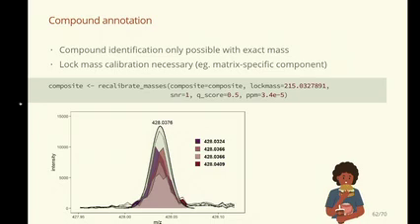So compound annotation, of course, reality is also difficult. If you really want to query databases, you will likely need a matrix-specific compound, for example glucose, and then shift towards this glucose. But together with the inter-batch mass corrections, the spectrum-specific mass corrections, and then a matrix-specific mass correction, we do get quite good feature annotation results.